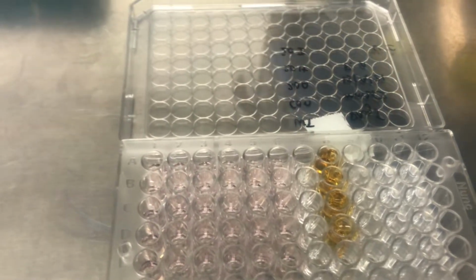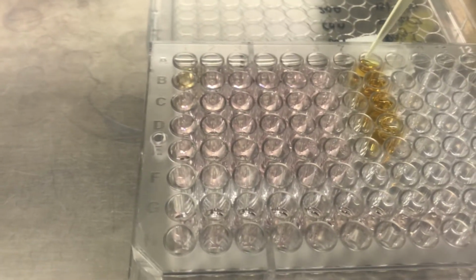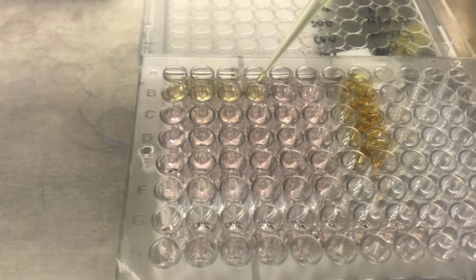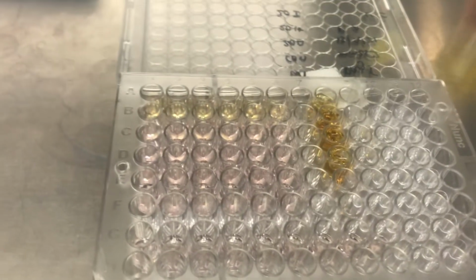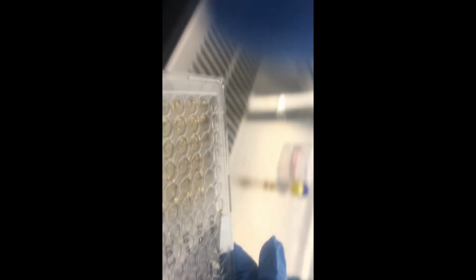And here we are using CellTiter 96 AQueous One Solution. That is the dark yellow one that I'm putting into each well. I'm using 20 microliters of this solution in each well. Here I'm using the same pipette because these are my replicates, and I just want to show you in this video how to do it.